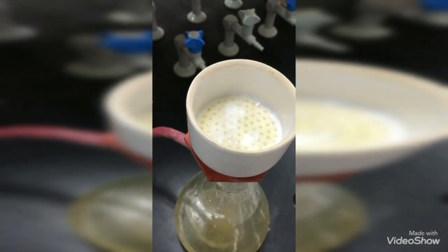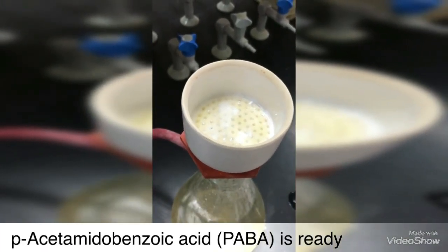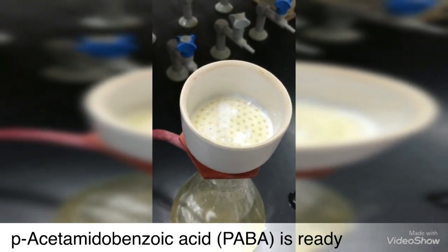Your product is ready. Take it off, put it on a filter paper to keep it dry for the next lab.